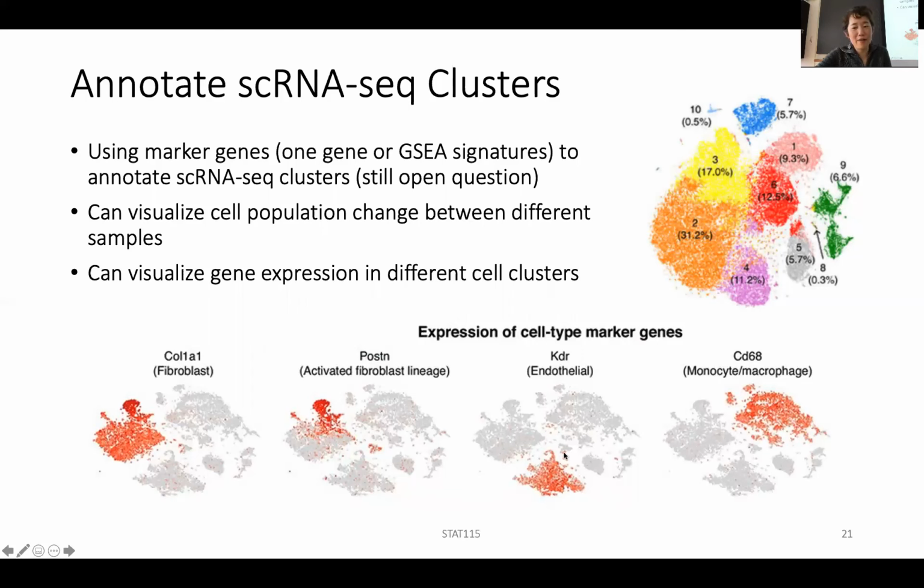In each cell, you ask t-SNE to draw the expression level of this one gene. You can see this gene is mostly expressed in this one cluster. It's not always there. You can see a lot of those gray dots. The reason is dropout. In some cells this gene is probably expressed, but you just didn't detect it.